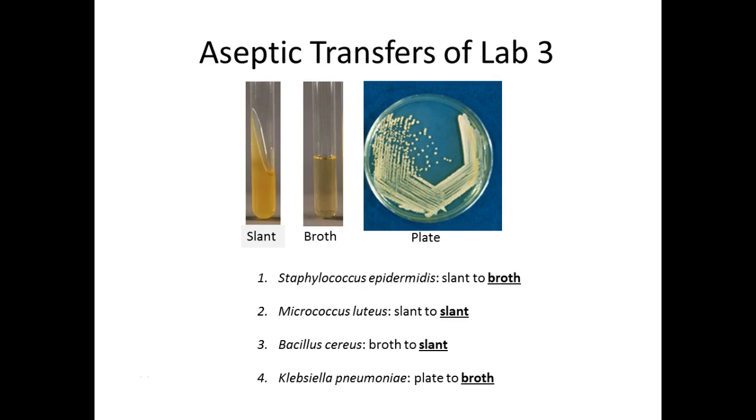Okay. So what we're going to do next, I'm going to put my lab coat on. You guys can get goggles. I feel pink today. We have the spray, or you can use the wipes. Remember the important thing with these, open up these vents so we don't clog up. And you have paper towels on your lab bench too, and I've got some up here. So, get your goggles, get an apron, grab a pair of gloves.